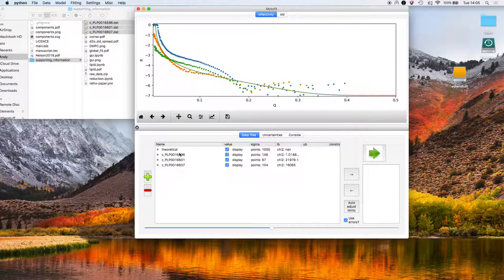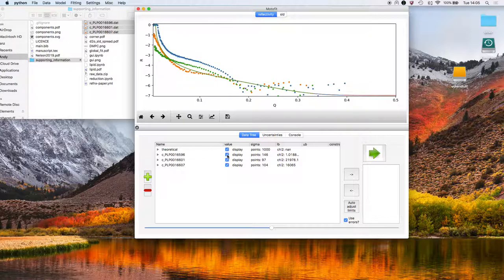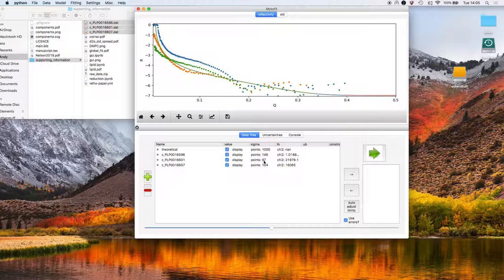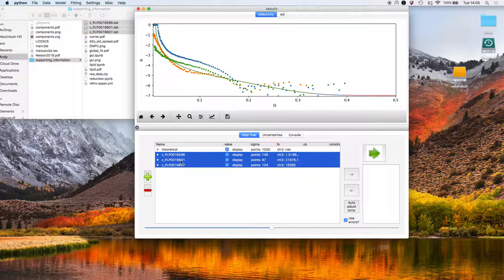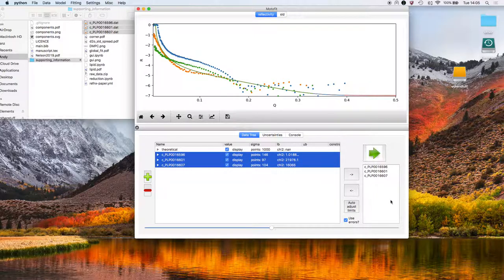These are the datasets down here. We can choose whether to display them or not. The number of points in each dataset and the chi-squared values. We're going to be fitting all three datasets, so let's select those and add them to the datasets to be fitted window.